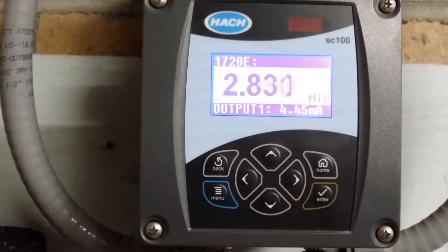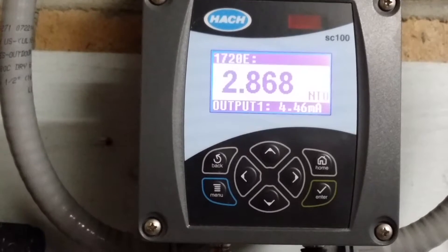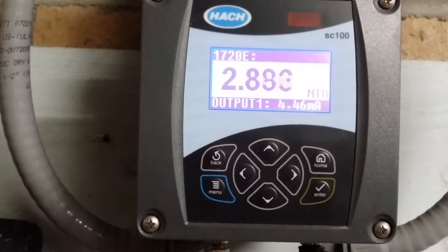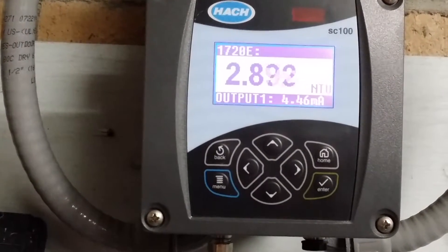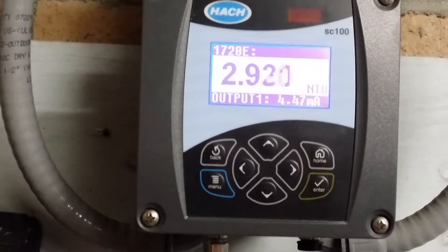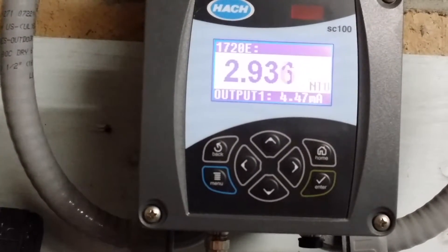Hello and thank you for tuning in to the SC100 Hach Turbidometer Controller. Here we are going to go through the process of how to hold outputs while in the test maintenance mode for cleaning, so that we don't disturb our turbidity readings that control our effluent diversion.